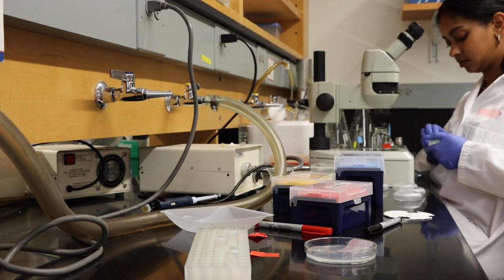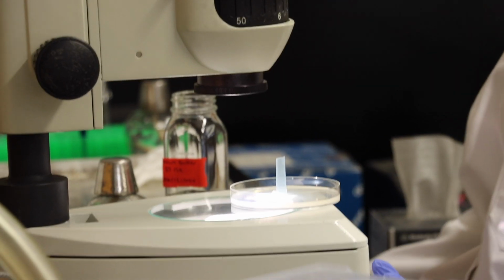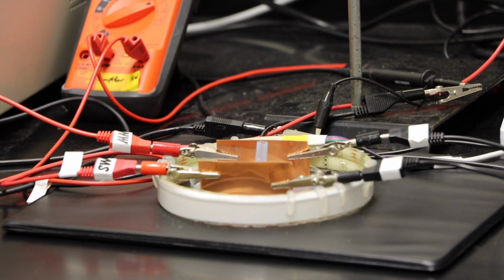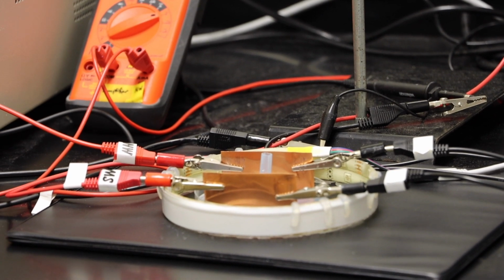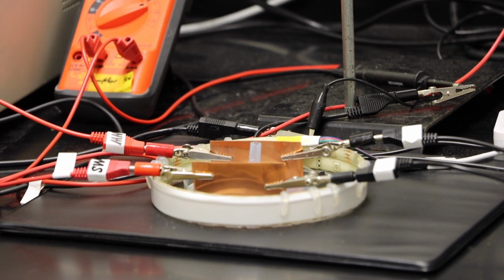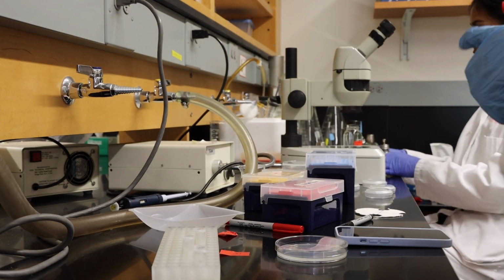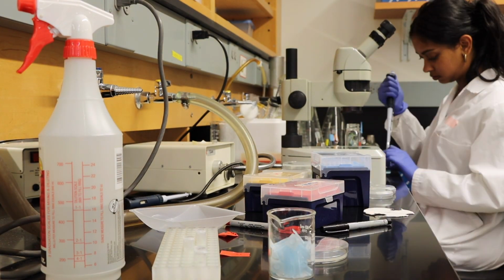After washing, the worms remain in the worm trap and are placed on the training plate that was spotted with isoamyl alcohol previously. Copper plates are placed in the training plate to allow the current to run through the plate. They are zapped for 60 seconds of 30 volts, 4 Hz, and 80 milliamperes. The chemotaxis plate is spotted with the diluted isoamyl alcohol and the ethanol in their respective circles.